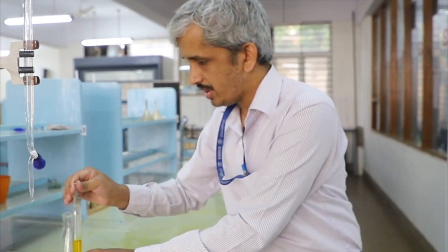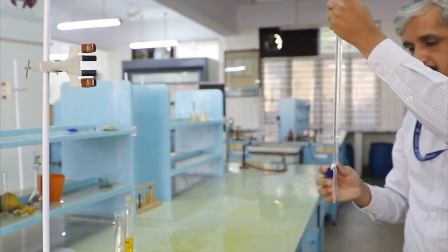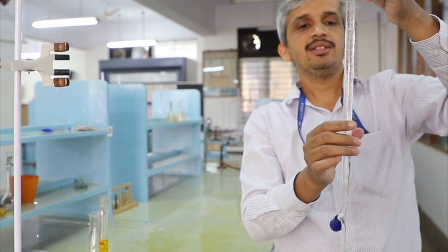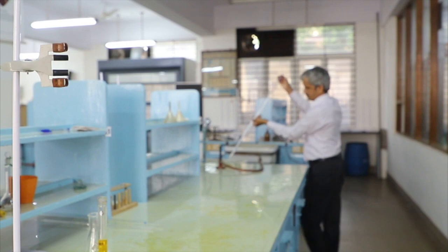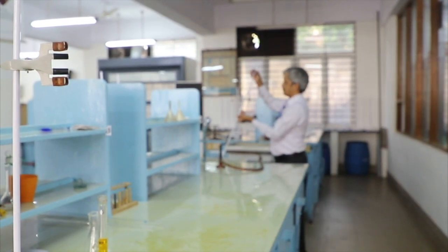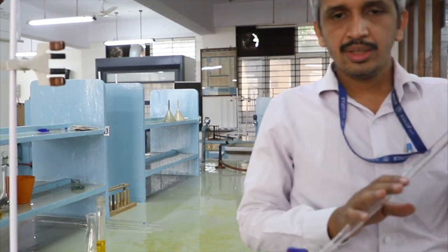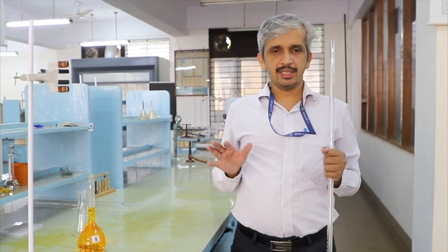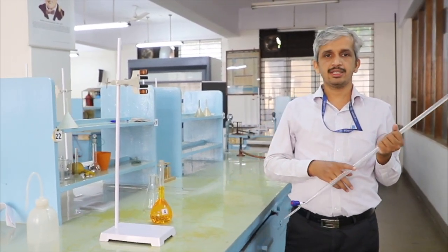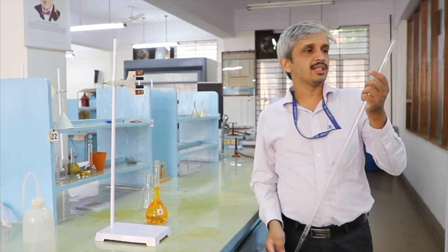Okay. So now how to fill the burette using the potassium dichromate. How to fill? You see, I have filled here the distilled water. I am going to discard this distilled water. So now the burette should be rinsed with the solution to be taken. The first point is, all the apparatus should be washed with tap water, then rinsed with distilled water. It is true for all the apparatus in the lab. And the rinsing with the solution to be taken.